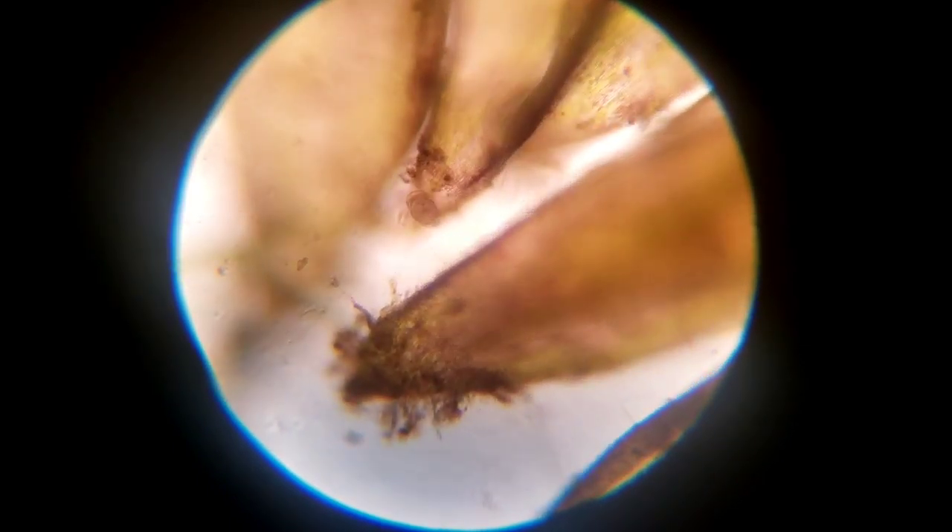There's just so much life. Here we have some blackbeard algae growing — this is actually just what it looks like up close. Instead of those square algae shapes, it's more of these little filaments and fuzz. What's going on here is this is an aufwuchs layer — I have a whole video on aufwuchs — which is biofilm layers of multiple species. What you're seeing here is there's some green algae in here, some filamentous hair algae.